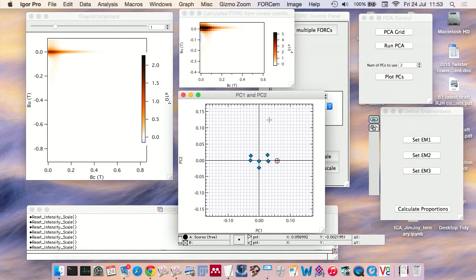If we go this way, we start to see something that looks like classic interacting single domain, or maybe slightly pseudo single domain, probably interacting single domain, with a much lower coercivity and the positive-negative signals that we've seen.